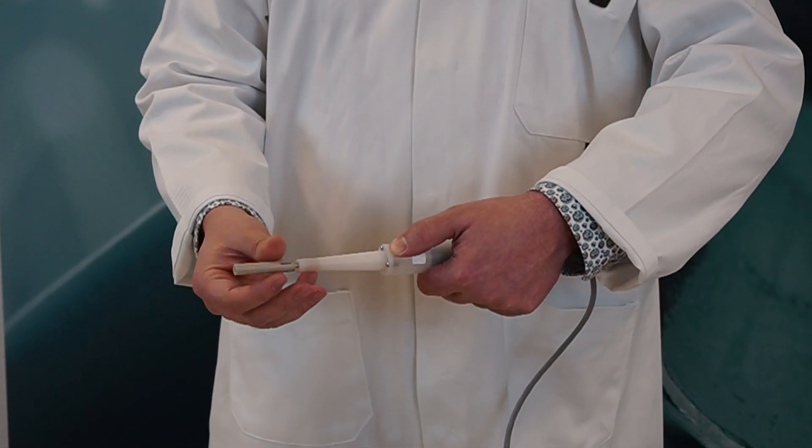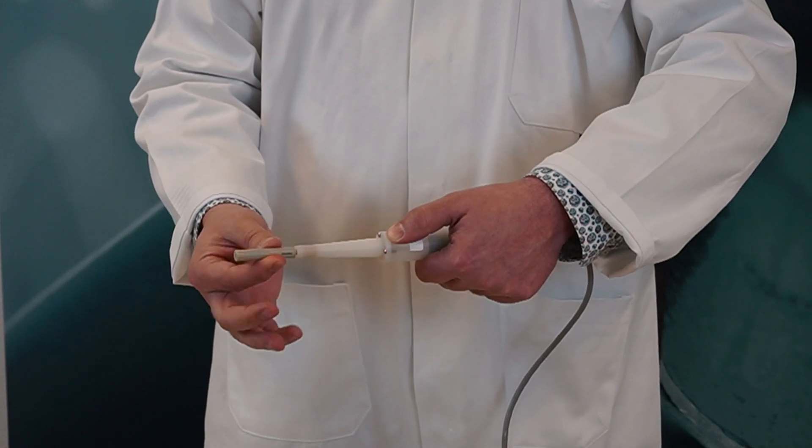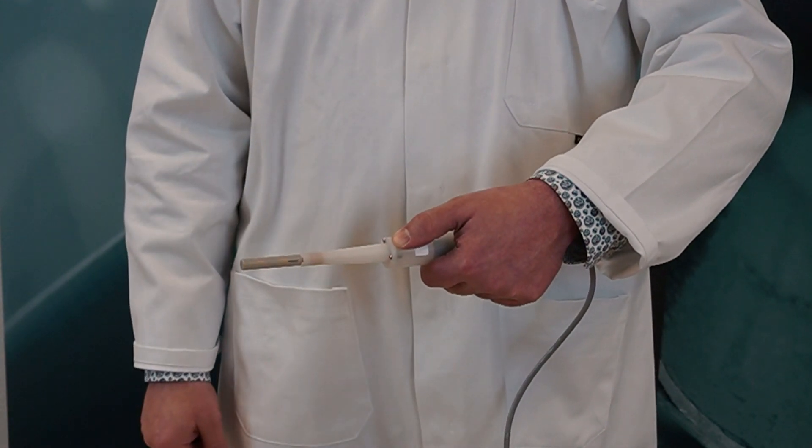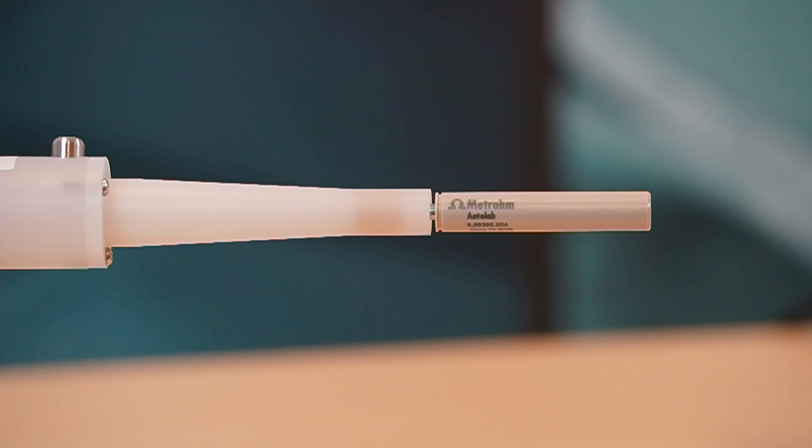The electrode tip should be finger tight and don't use any wrenches or other tools to tighten the electrode tip. There should be a small gap, shown here, between the electrode tip and the rotator. I remind you not to use any tools to tighten the electrode tip.